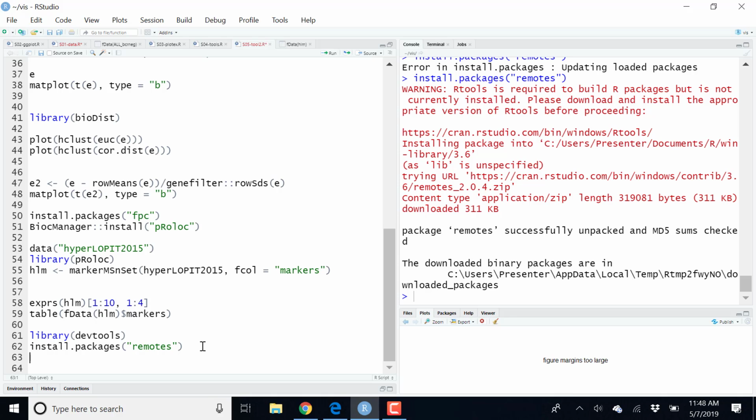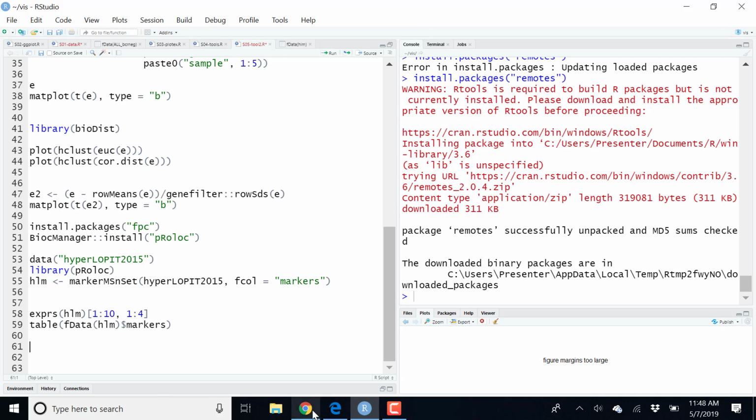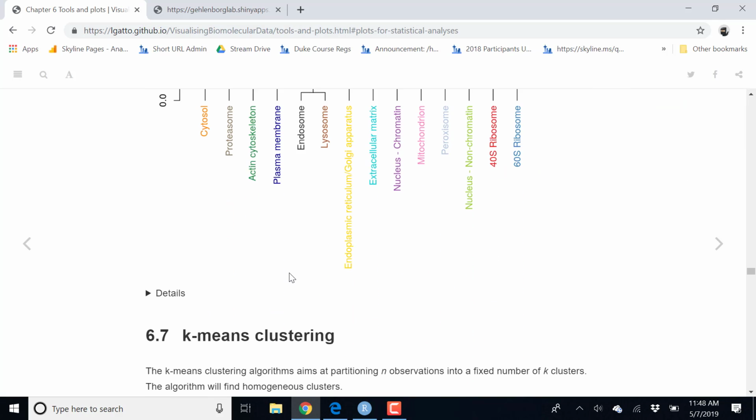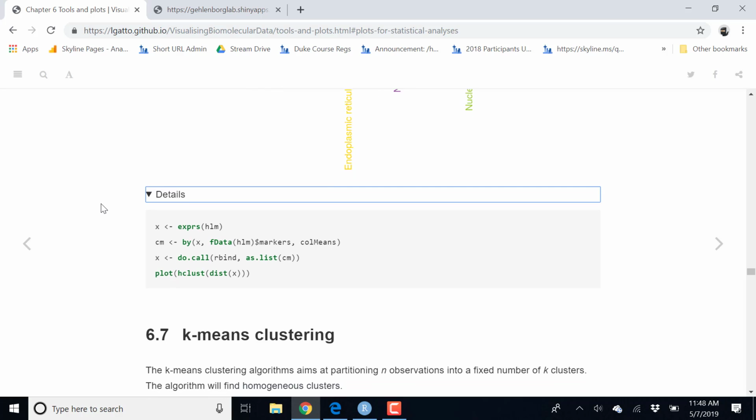Okay, let's proceed. I don't think we're going to try to install these dependencies one by one. Sorry about that. I'm going to show you my suggestions for this exercise, and then we'll move on and use another one for the next part.